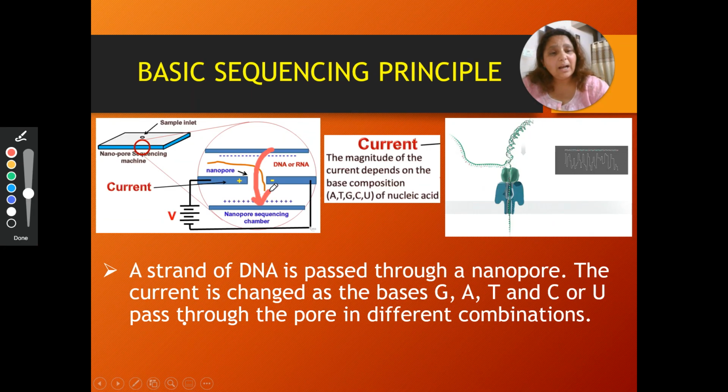But imagine करिए कि ये एक hole है, and water is flowing through this hole from a region of higher potential to a region of low potential. अब imagine करिए कि इस waterfall में आप ball डाल देते हैं, तो जब वो ball pass होती है through that waterfall, through that hole, a change is produced in that waterfall. That change can be monitored.